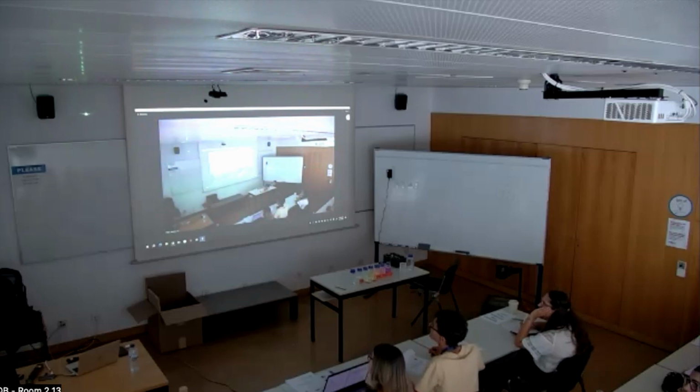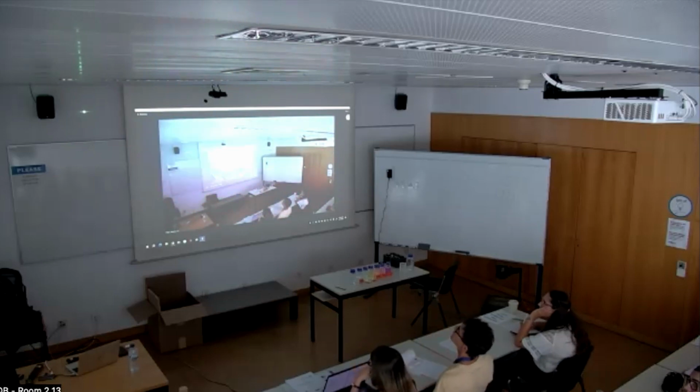Okay, so more spots here. And the distance, what about the distance? That's because there is a higher frequency of spots, right? So the distance between spots is smaller. Okay.